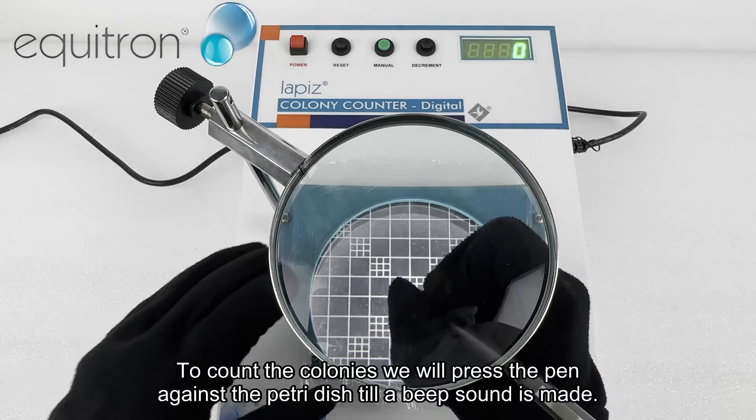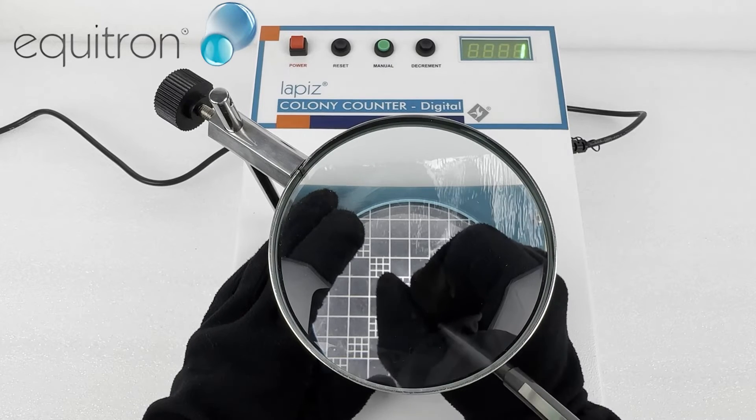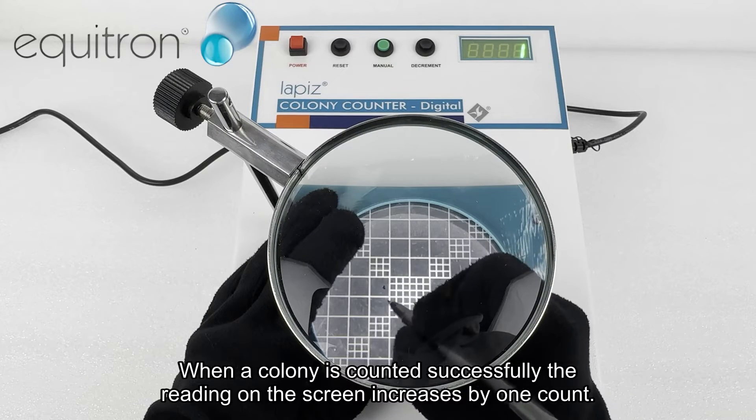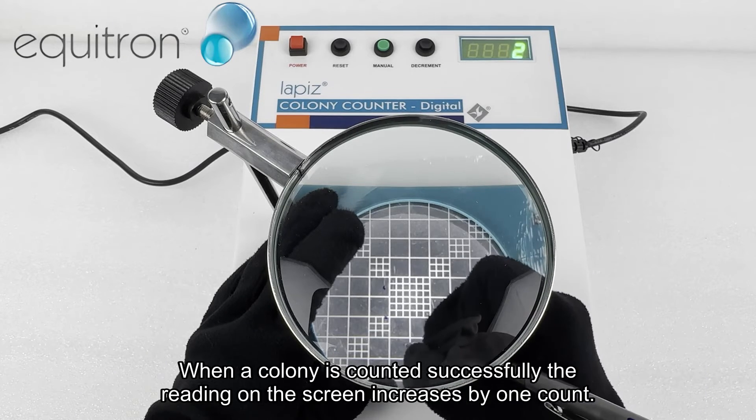To count the colonies, we will press the pen against the petri dish until a beep sound is made. When a colony is counted successfully, the reading on the screen increases by one count.